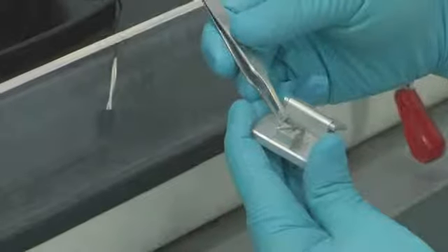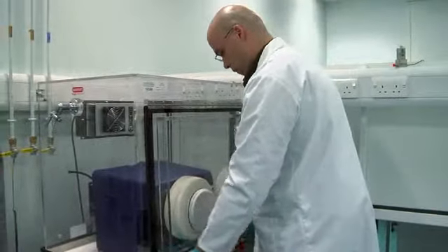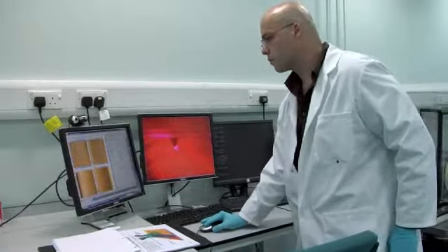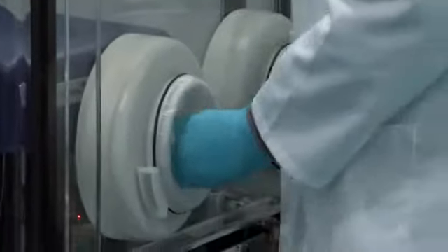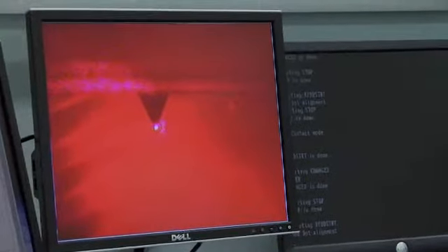DPN can print sort of sub 500 nanometer spots. So we'll take a tip, which is really almost like a small fountain pen, and dip it or coat the tip with a chemical of interest. DPN is considered a soft lithography technique, which means we can use nice mild conditions that proteins are comfortable in. There are other methods which can do it, but to do it routinely and over a large area, DPN really is the only alternative. In the long run, Aaron's work with stem cells may open the door to treatments for many of our most deadly illnesses.